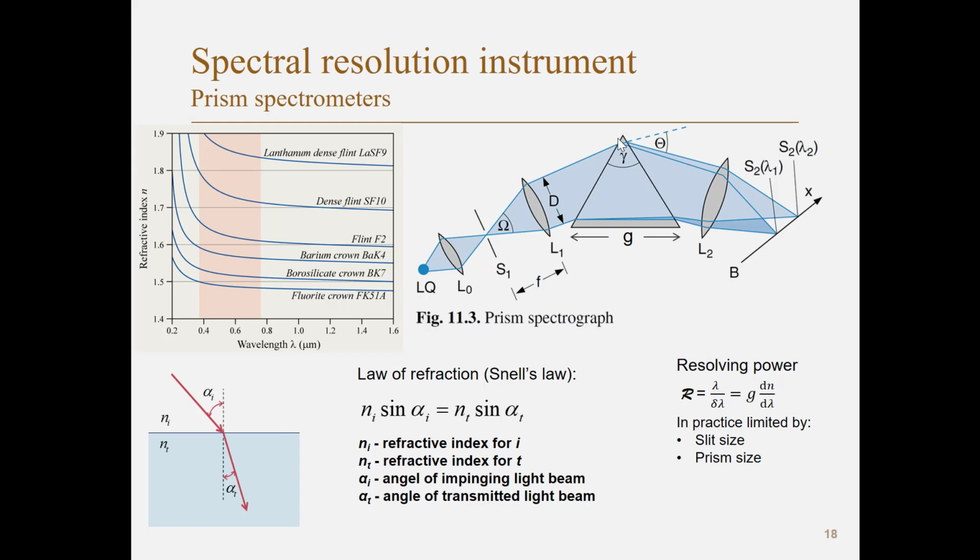When we hit the first facet of a prism, the direction of the beam is changed. Then we hit the second facet of the prism, and the direction of the beam is changed again. How much change we have depends on which wavelength of light we have, because we have different indices of refraction for these two wavelengths. So for one wavelength we have a beam coming out like the top beam here, and for the other wavelength a beam coming out like the lower beam here, with different directions.